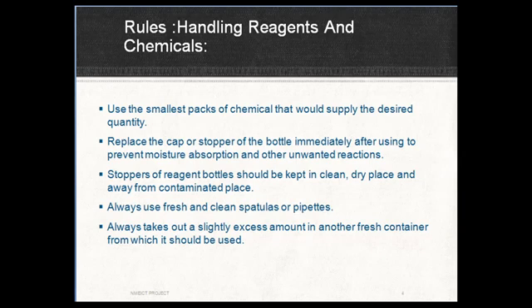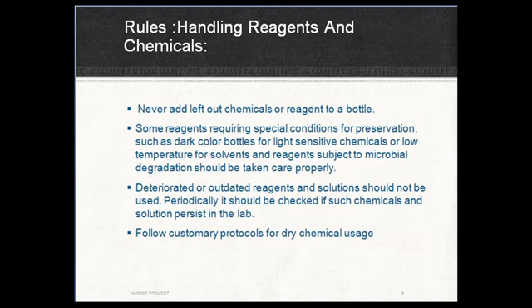Always use a fresh and clean spatula or pipettes. Always take out a slightly excess amount in another fresh container from which it should be used. Never add leftover chemicals or reagents to a bottle. Some reagents require special conditions for preservation, such as dark bottles for light sensitive chemicals or low temperature for solvents and reagents. Deteriorated or outdated reagents and solutions should not be used. Follow customary protocols for dry chemical usage.